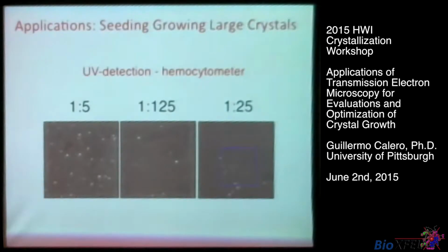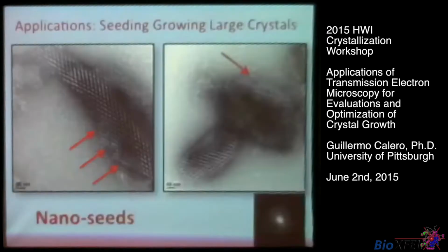So let me go back to seeding. This is what we did. We used these seeds that you see here. We have these seeds now. So how can we use this to really grow large crystals?